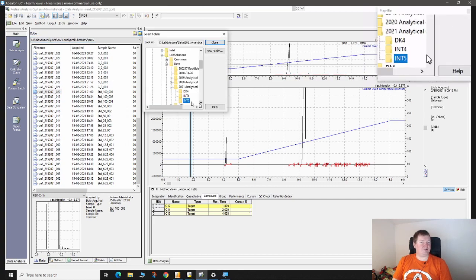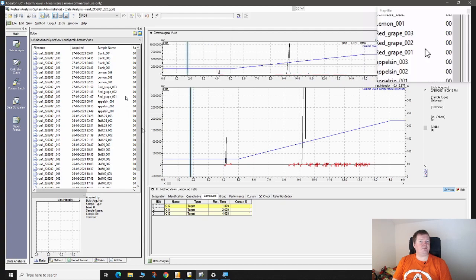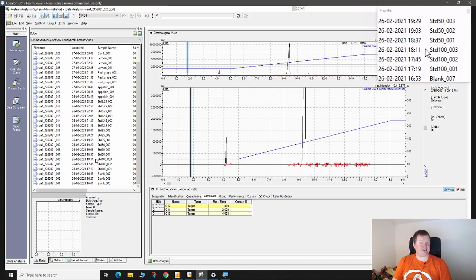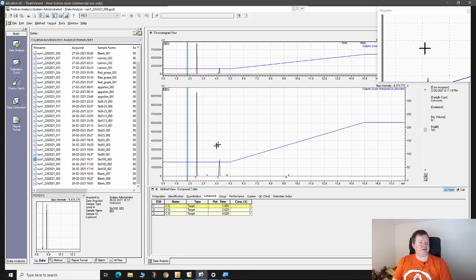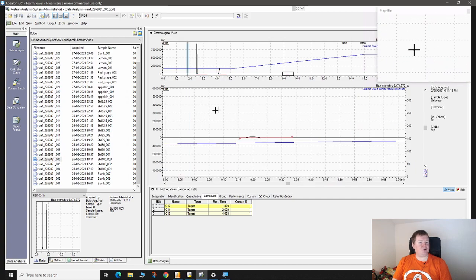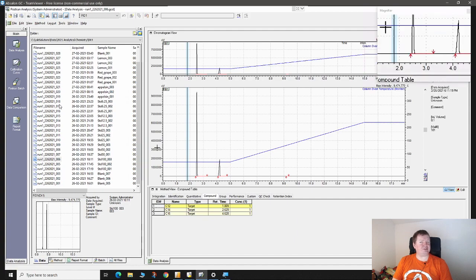You know, we're just going to check one of the other groups. What do we say to international? We'll take this one perhaps. Take a standard 100 again. So this is group 4 of the Danish team. Let's see. Again, we have some peaks here. Have a peak there. We have a small peak. Actually, that's probably due to scaling, because that's actually quite a large peak. So that should be fine.